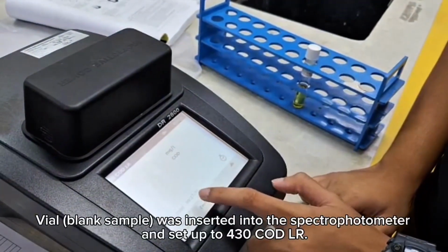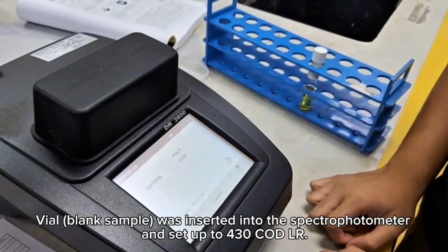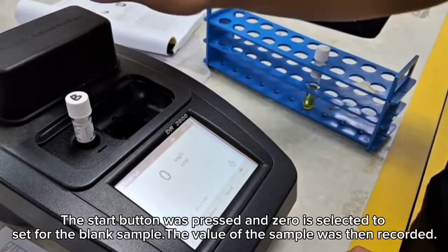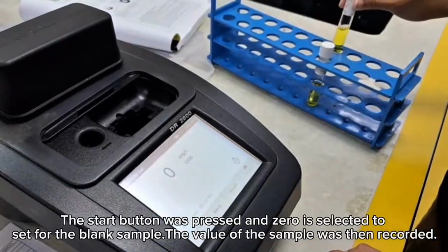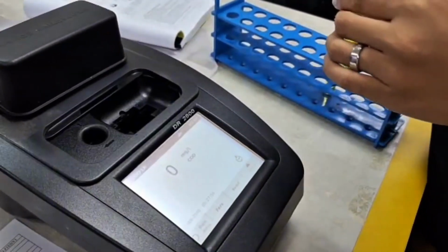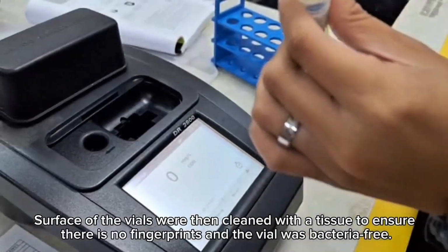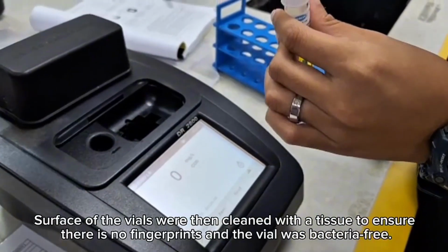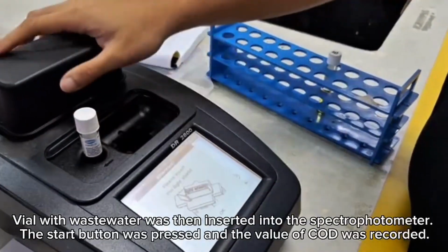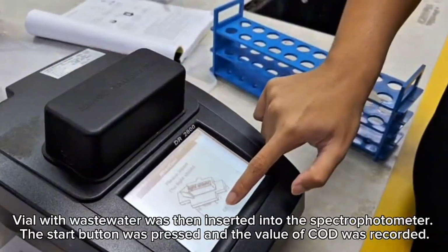The blank vial was inserted into the spectrophotometer and set up to 430 COD LR. The start button was pressed and 0 was selected to set the blank sample. The value of the sample was then recorded. The surface of the vials was cleaned with a tissue to ensure there are no fingerprints and the vial was bacteria-free. The vial with wastewater was then inserted into the spectrophotometer. The start button was pressed and the value of COD was recorded.